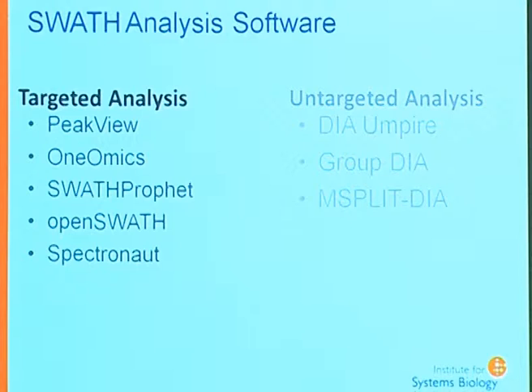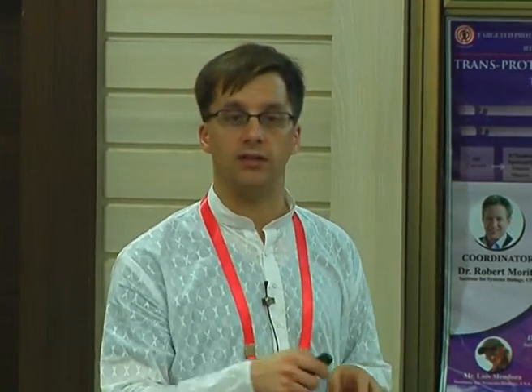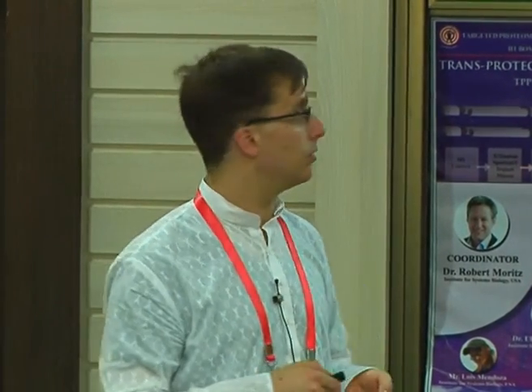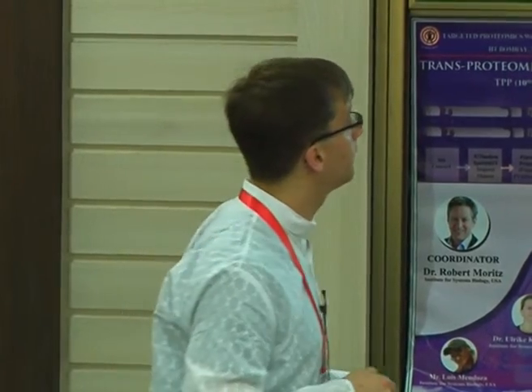So this is a short rundown, the way I'm going to present it. Usually what you would start with is either get a library from SWATHAtlas or make it yourself. I placed it down here because then we can load a session and look at the results, and that takes some time. So this way, we use the time a bit more efficiently. But usually that would be the first step.